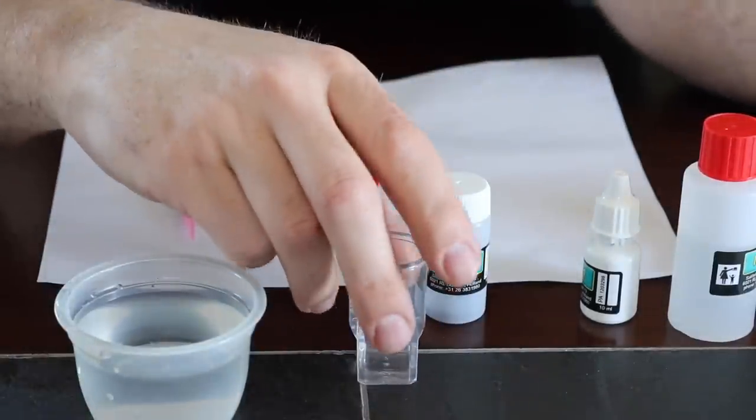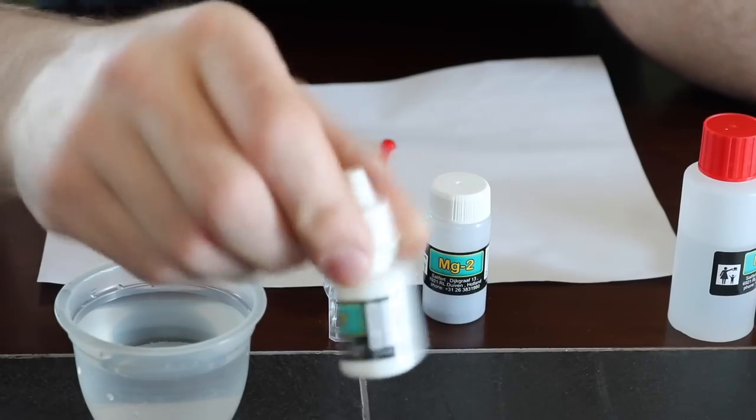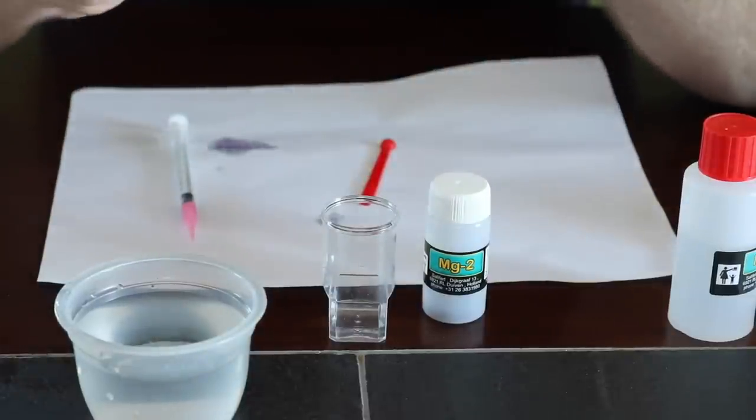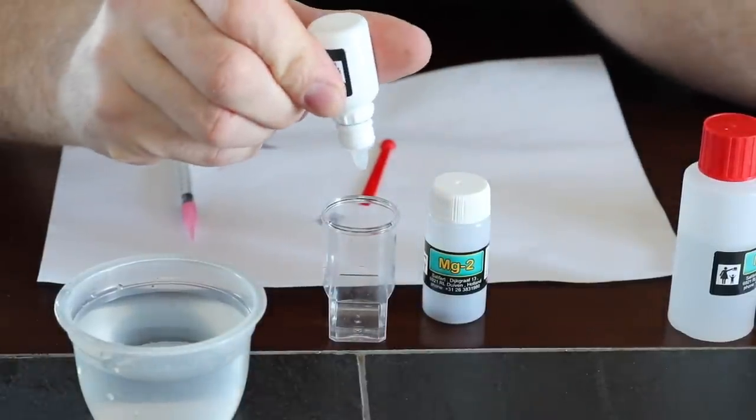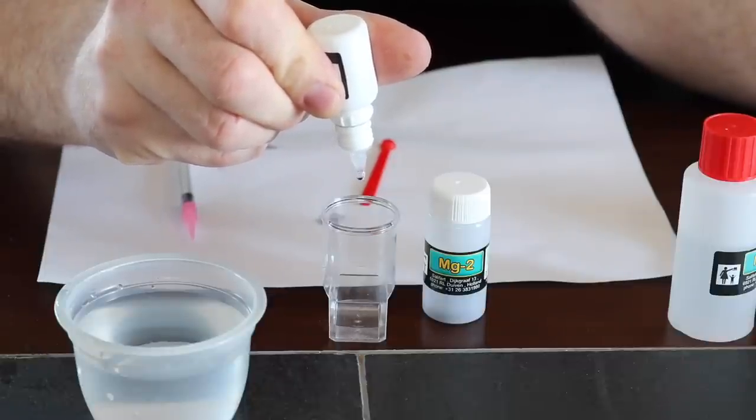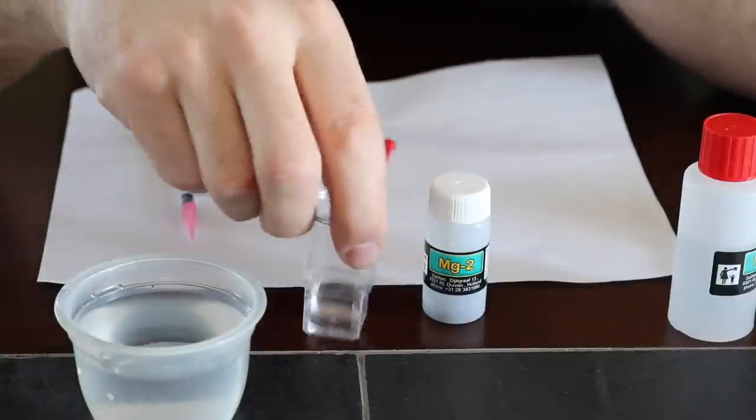So what we're going to do now is we're going to take the MG1 and we're going to add five drops. We'll just shake that up a little bit and make sure everything's mixed. So we're going to add five drops to our test sample. One, two, three, four, five. Alright, and we're going to put that one to the side and we're going to mix this for 30 seconds.